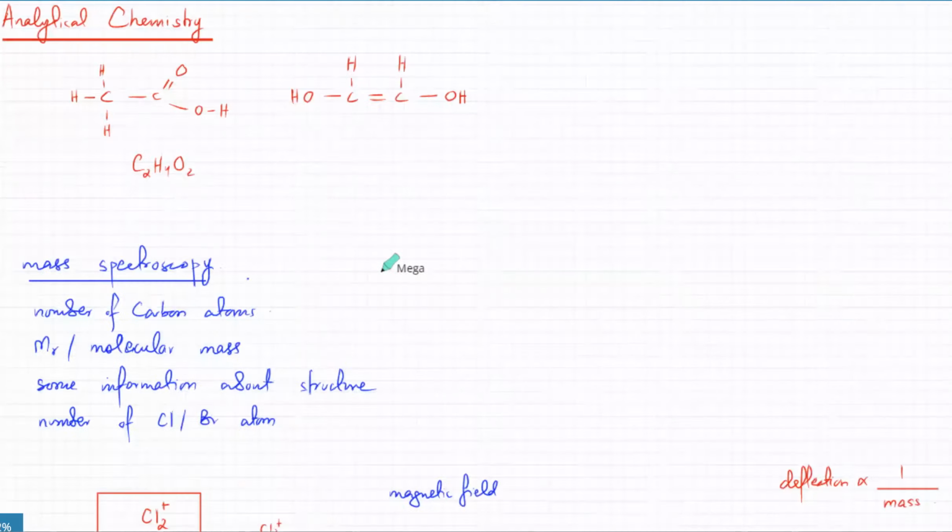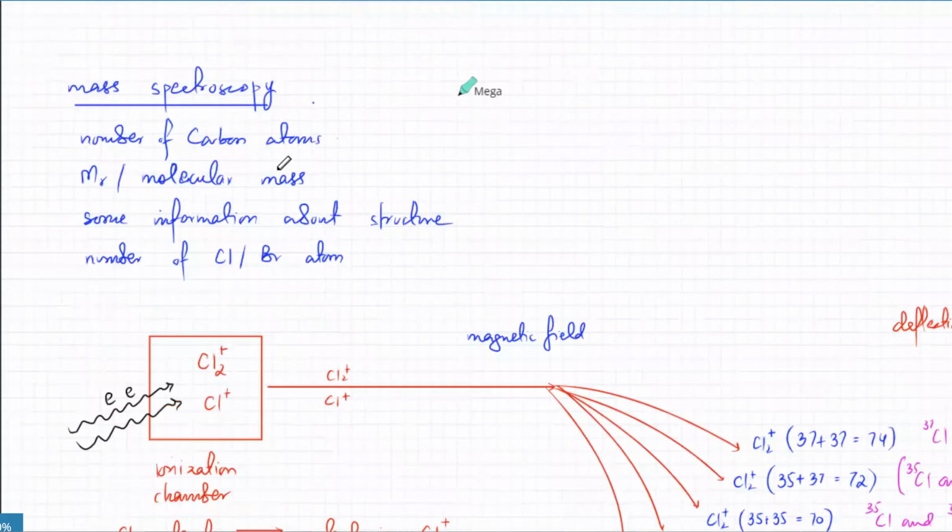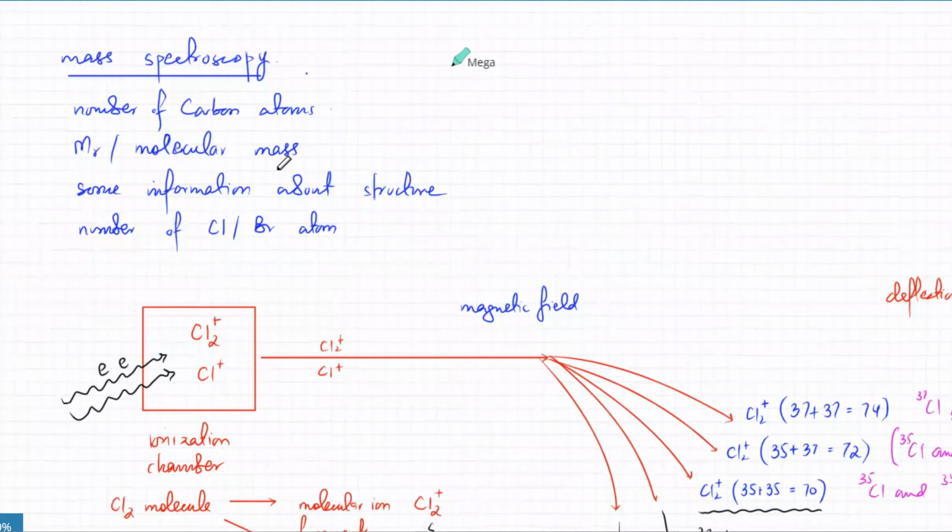Just so this one, the very first thing that you know about a molecule is, I mean, how do you get this information? Like which atoms are present in a molecule? You don't see anything. So how do you figure out the structure of the molecule? So you do mass spectroscopy. That's the first analytical technique that you do.